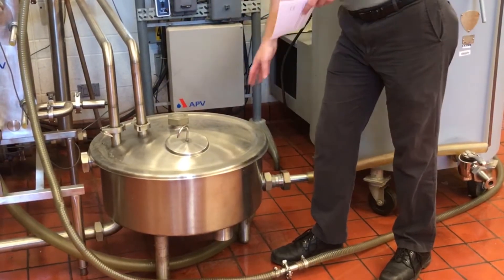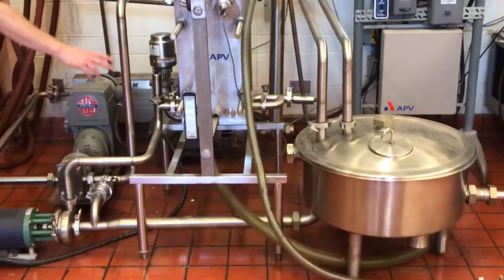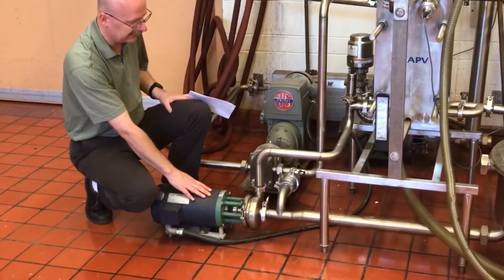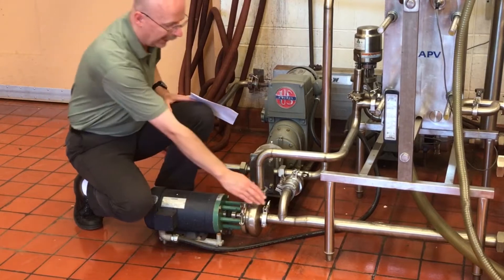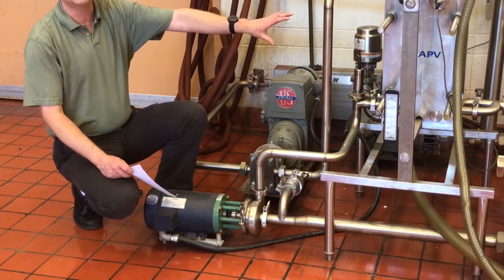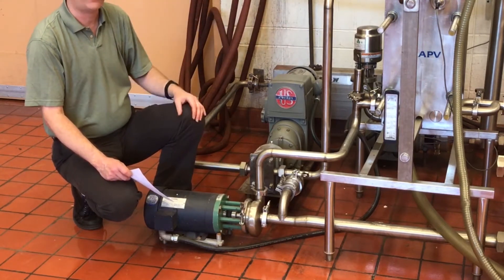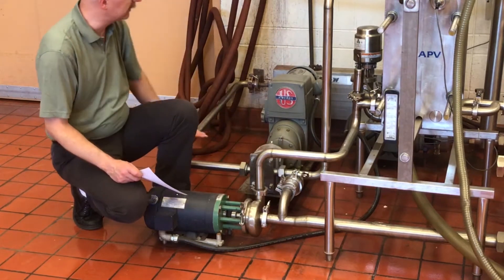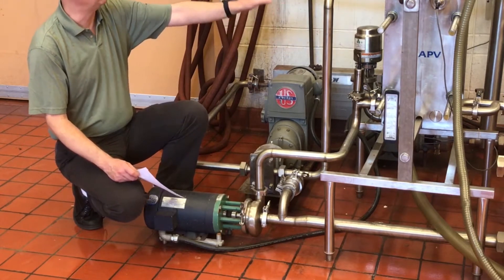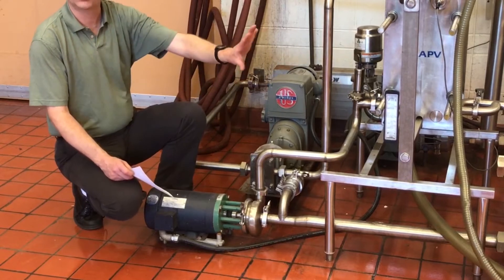From the constant level tank the milk then flows through the pipe to our booster pump. Our booster pump has two exits for the raw milk. We have a bypass valve here which, when we're starting up and we have no pressures or temperatures in our plate heat exchanger, we have to utilize the bypass. The milk is fed in, starts heating up, regulating pressures, and will be diverted back to the constant level tank to be fed through again.